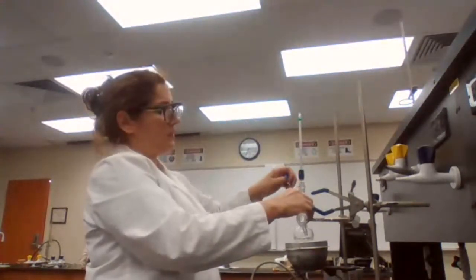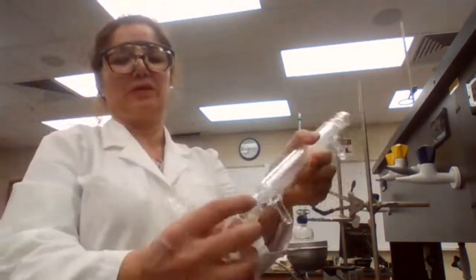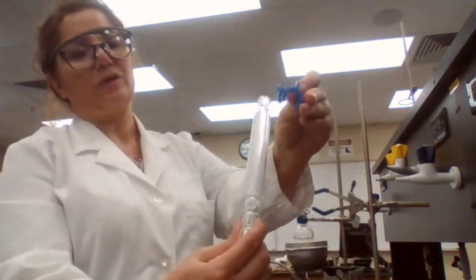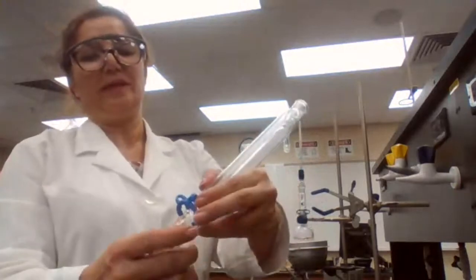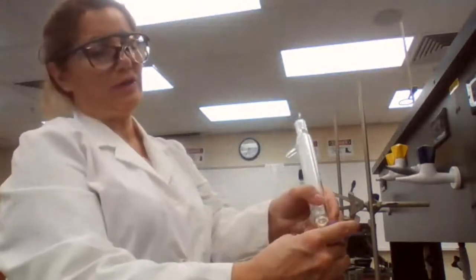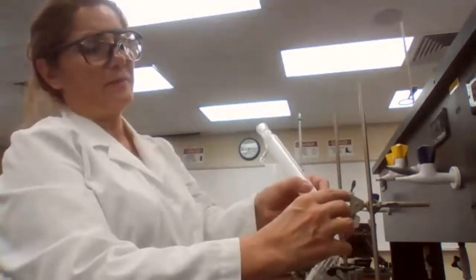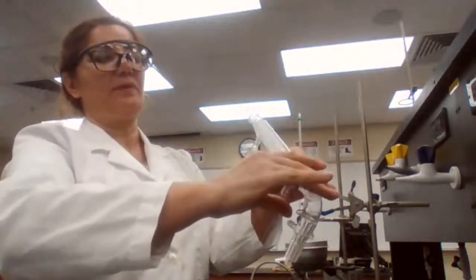When you attach the two glass pieces together, I'm going to show you closer here. See, this area has a larger bump and then a smaller one. So this clamp has to go just in between, in a way that the large side stays on the larger diameter and the small side on the other side. And you hold your thumb underneath and push from the top.